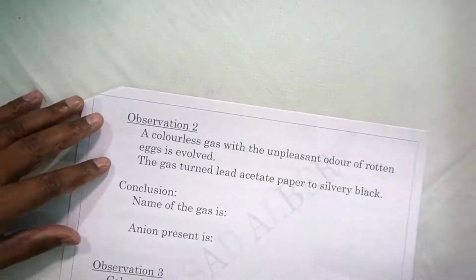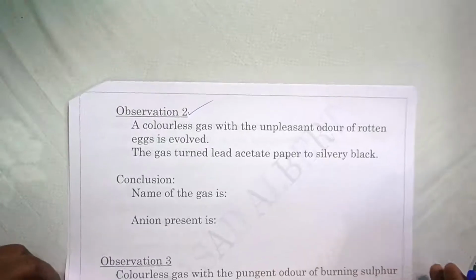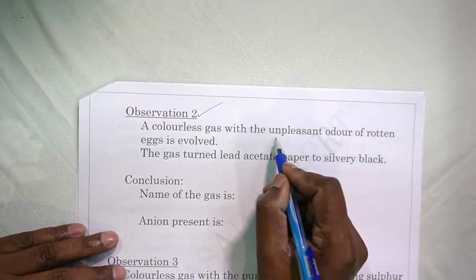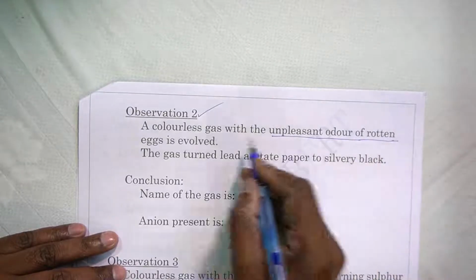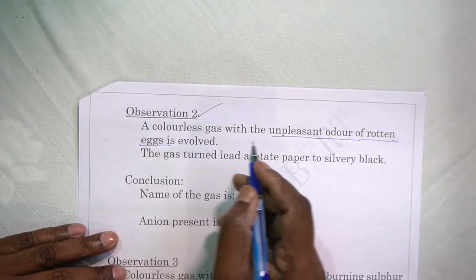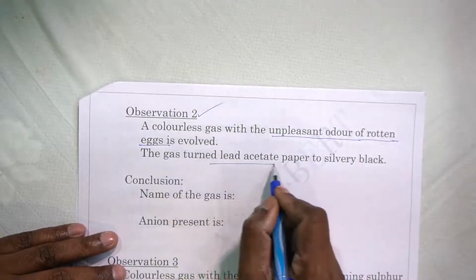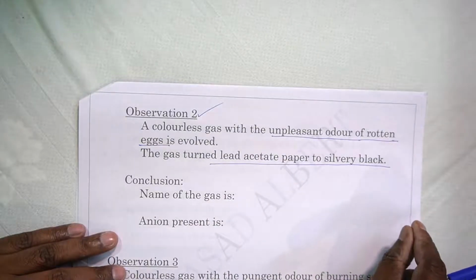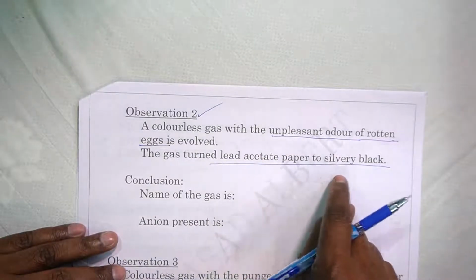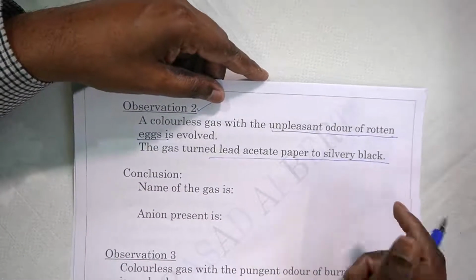Now, when you add dilute sulfuric acid to the substance, if these things did not happen, some other observation is possible. The second observation is a colorless gas with an unpleasant odor. You don't like that smell. It's the smell of rotten egg. Such a bad, foul smell comes. The gas also turns lead acetate paper silvery black. If you dip a filter paper in lead acetate solution and introduce it to the gas, the paper will turn silvery black, black and at the same time shiny, right?